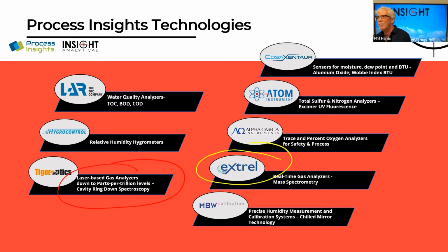Extrel is an interesting one for me. When I started talking with the Process Insights people about working with them, it was pretty exciting to get the opportunity to work with Extrel. They've been a company with a long history back into the 60s. But the big thing for me was, before they became Extrel, they were a company called Extranuclear. When I was doing my graduate work in chemistry, which, with the amount of white hair I have, you've got to realize was a long time ago, early 1980s, I was using an Extranuclear mass spec in the lab. So I've got a long history with mass spectrometry and specifically the companies and technologies that came to be Extrel. When we start to look at process mass spectrometry, these guys really made that industry.